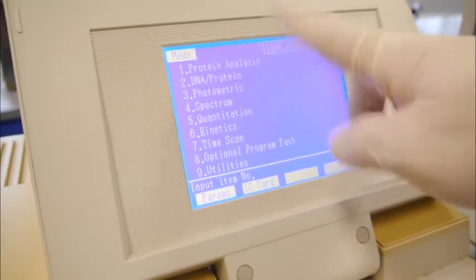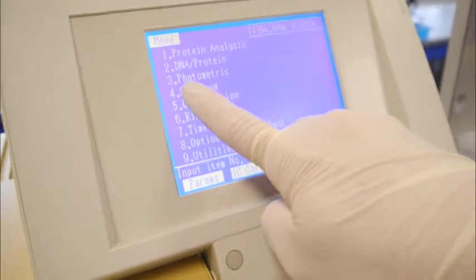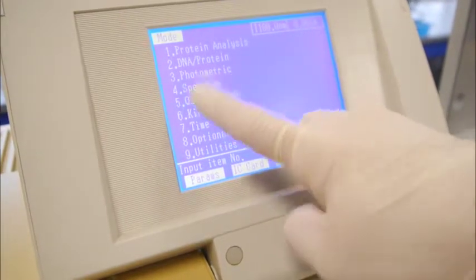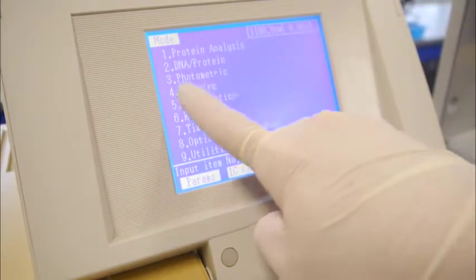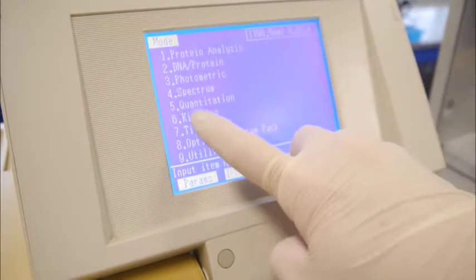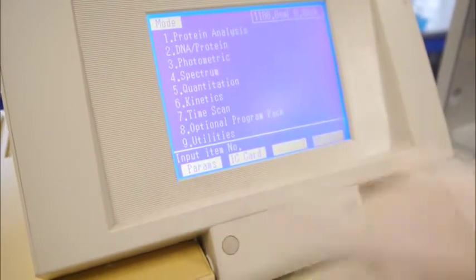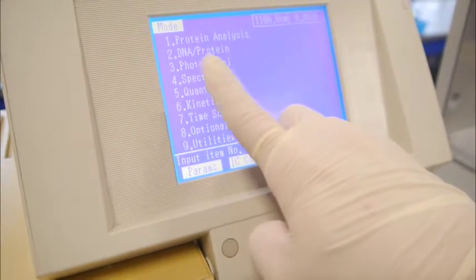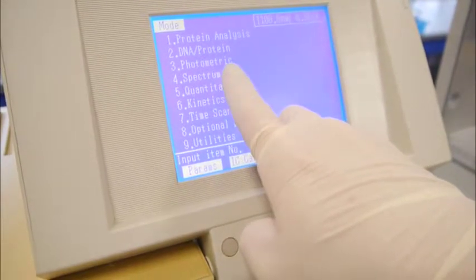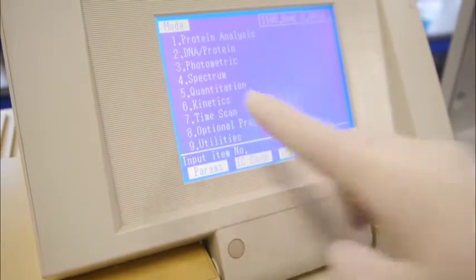Now we can actually use photometric modes for your measurement of the samples, but the operation method will still be the same as single-bin UV visible spectrophotometer. So we will move on to talk about quantitation mode instead of photometric mode. You can refer back to your single-bin UV visible spectrophotometer video for the photometric mode. Now we will move on to measure using quantitation mode, so press 5.